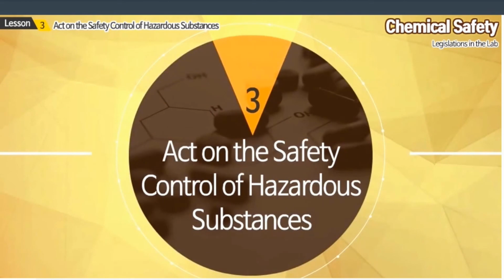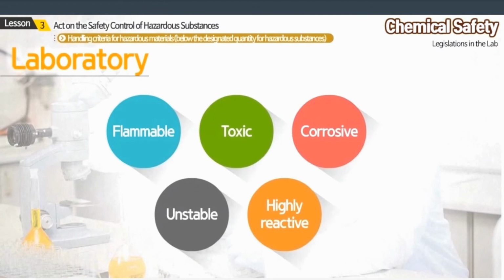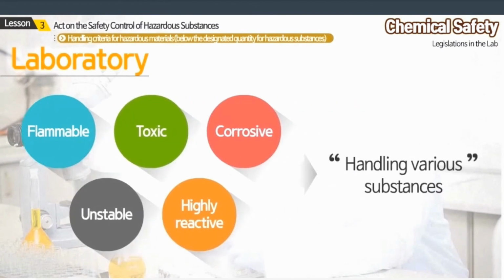On the safety control of hazardous substances. Laboratories generally handle flammable, toxic, corrosive, unstable, and highly reactive chemical substances. They handle a wider variety of smaller amounts of chemicals compared to mass production facilities.